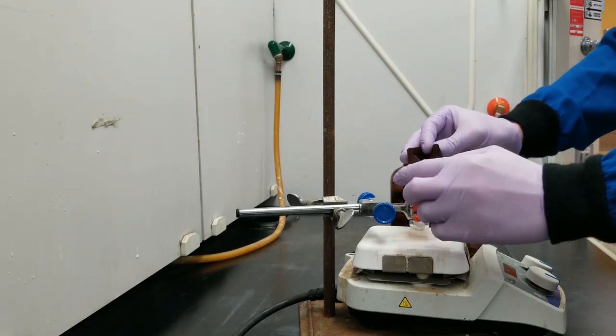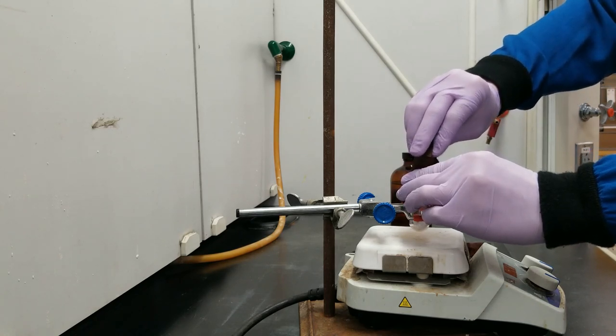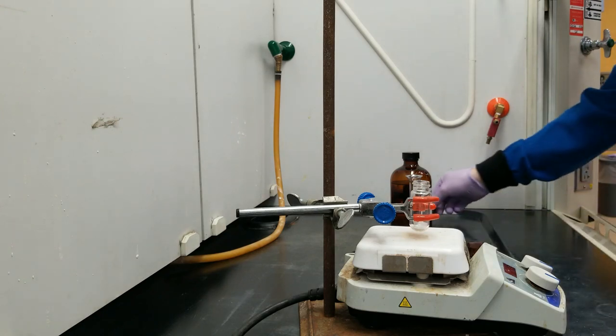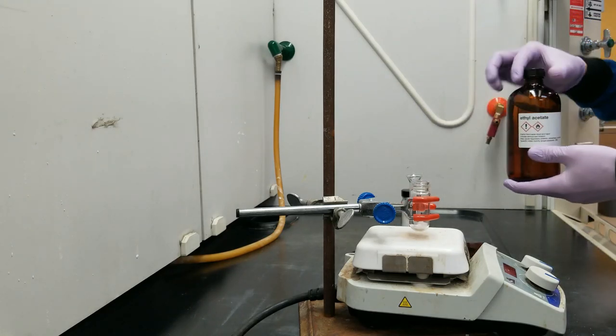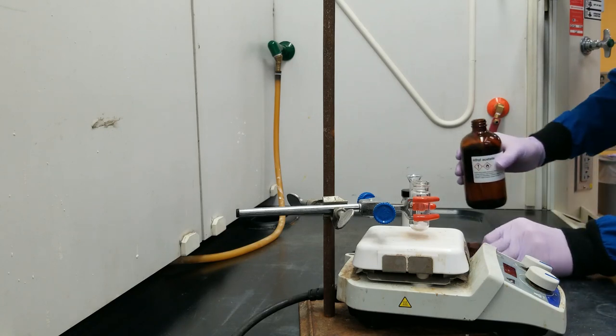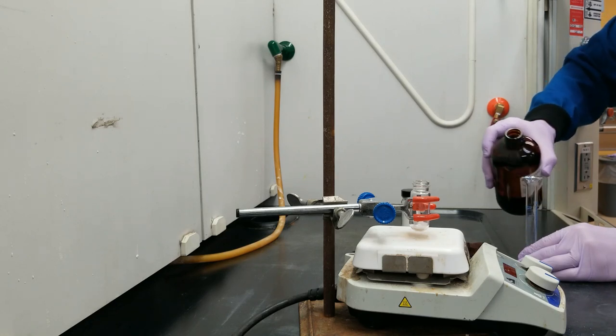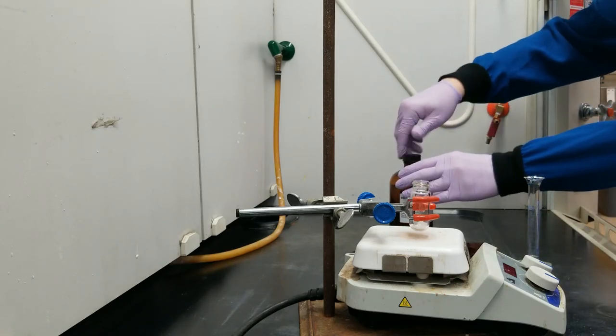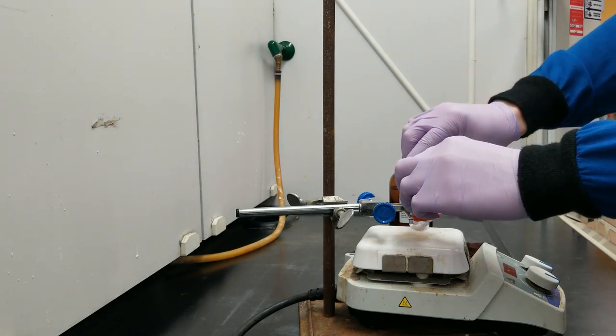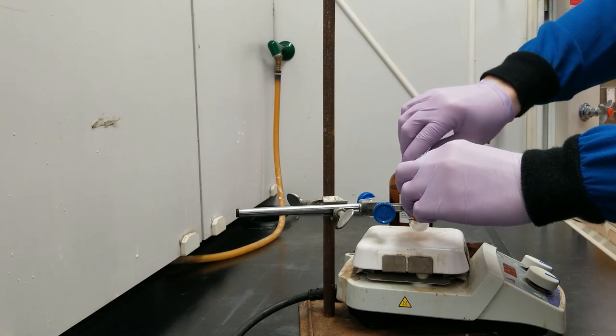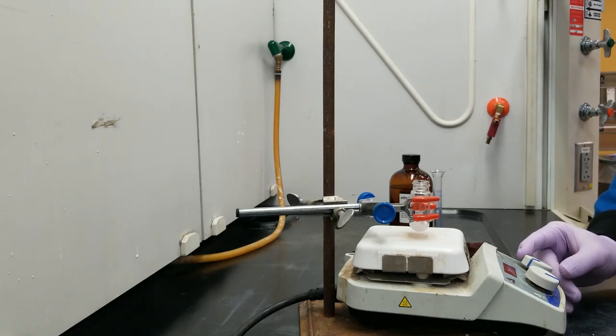So this is going to go into our 10-milliliter round bottom flask. This is going to be dissolved in ethyl acetate, which you can see right here. You can measure up one milliliter of this. And this is purely acting as the solvent in the reaction. It's not involved in the mechanism. One milliliter of ethyl acetate. And I'm going to go ahead and get this stirring, just to let that borneol dissolve.